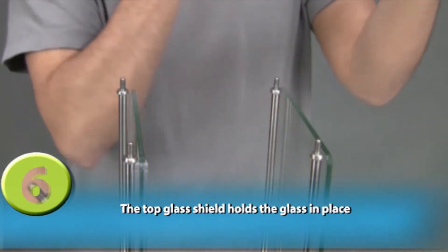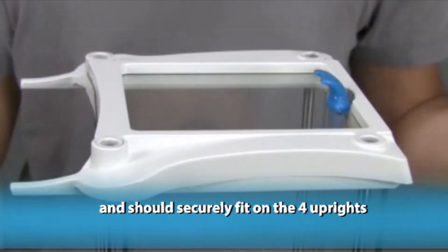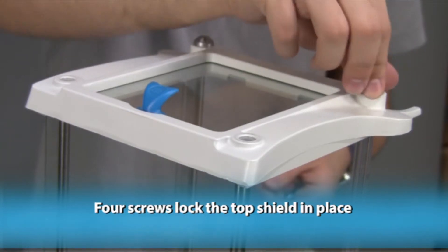The top glass shield holds the glass in place and should securely fit on the four uprights. Four screws lock the top shield in place.